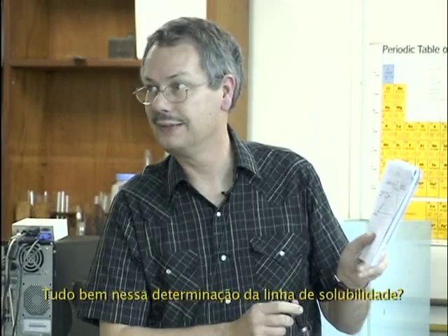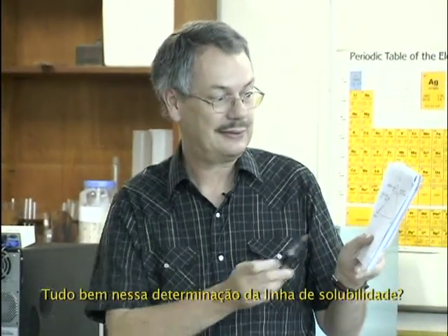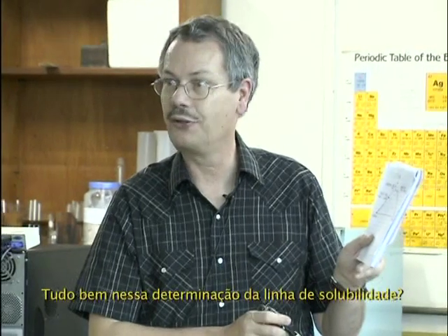Okay, on this binodal curve determination.